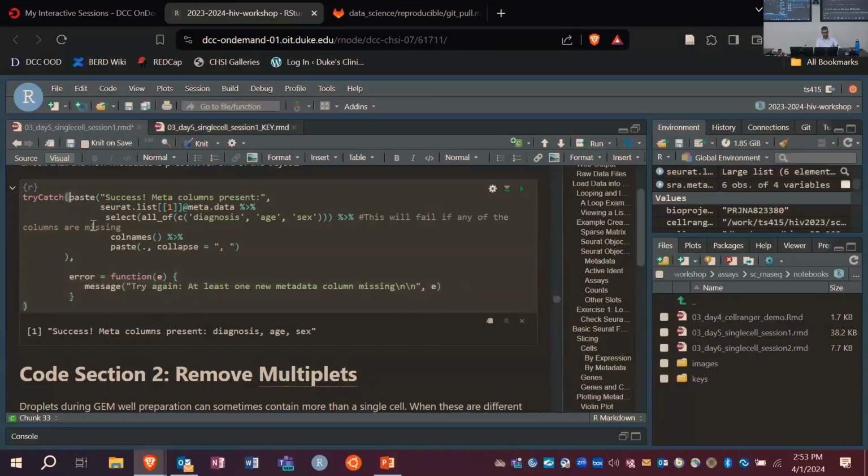It essentially allows you to run any R function that might fail and give you an error; it keeps going with that function and just reports the errors to you. So in this case, either way, it was going to report a message, whether success, you did it, or failure, here's a message for the failure. But yes, you could use this for checking a lot of things.